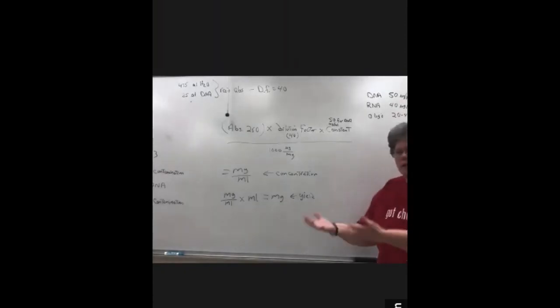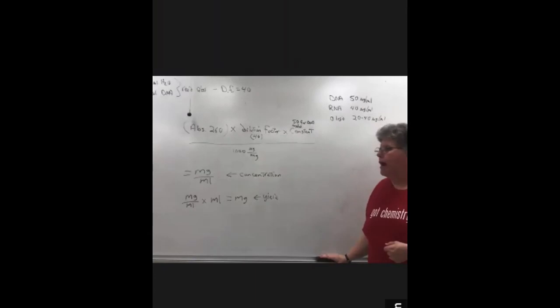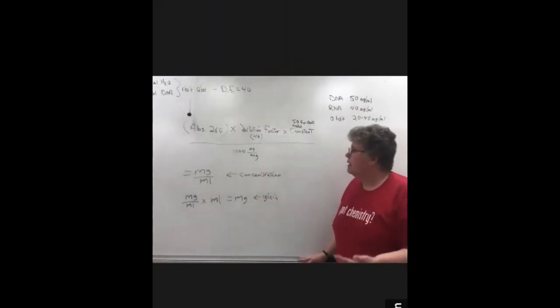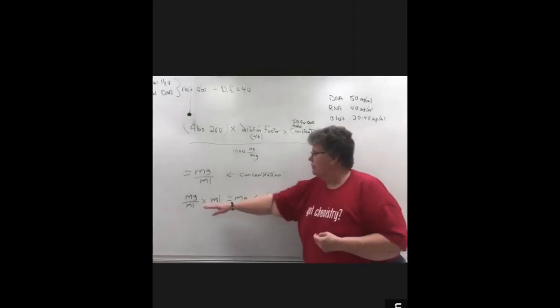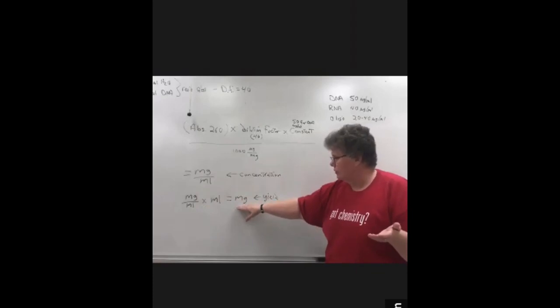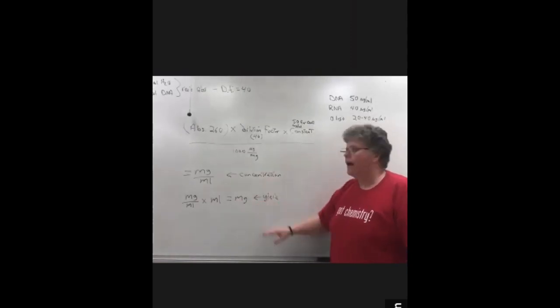You want to get it to a more usable number, so you're going to divide by 1,000 micrograms per milligram, and then your numbers will be in units of mg per mL. If you have brought up your DNA in 1 mL after you precipitated it, that makes the math easy. Mg per mL times mL, this would just be 1. So if you look at the units, milligrams, and that's your yield of DNA. So you have your concentration, which is mg per mL, you have your yield.